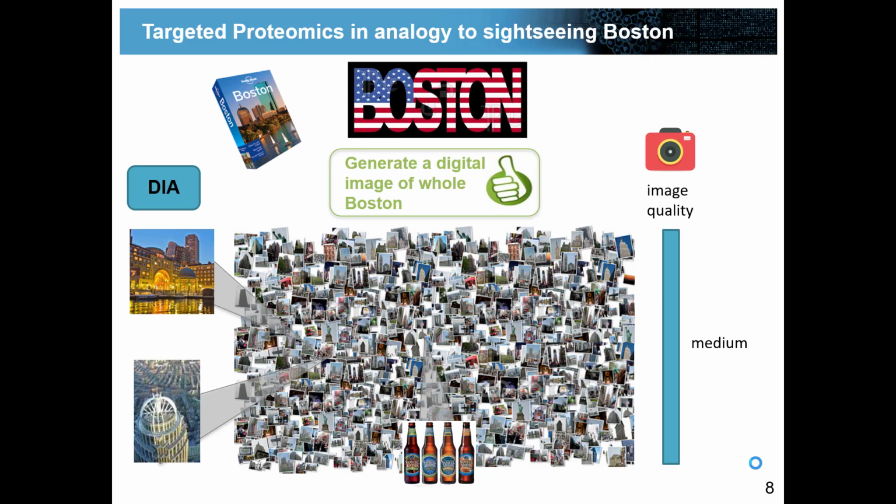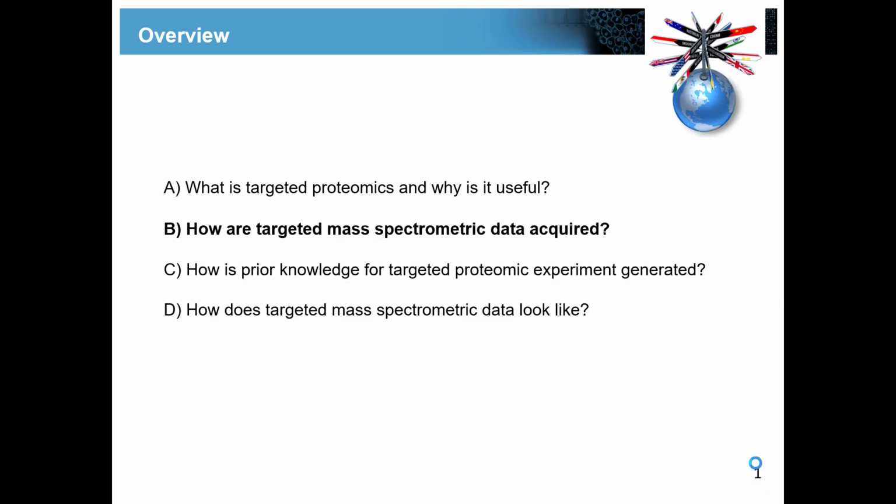Okay, are there any questions? So I think this gives you an idea about the differences. And if you are interested in learning more also about PRM or DIA, which we will not cover so much in these 2.5 days, please come and see me to speak about the technical aspects of it.